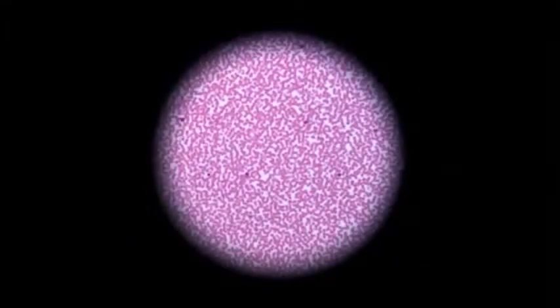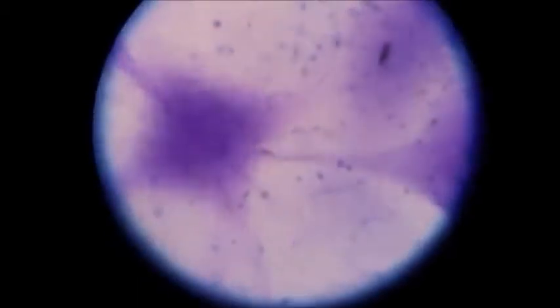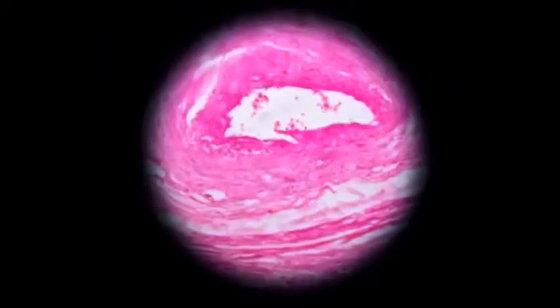The photomicroscope makes observing of specimens a lot easier. It produces photographs of specimens. The photomicroscope is not that different from the ordinary microscope that we are very familiar with. The only component that a photomicroscope has is a camera that produces digital images which can be used for processing, analyzing, and presenting images of specimens obtained from the microscope.